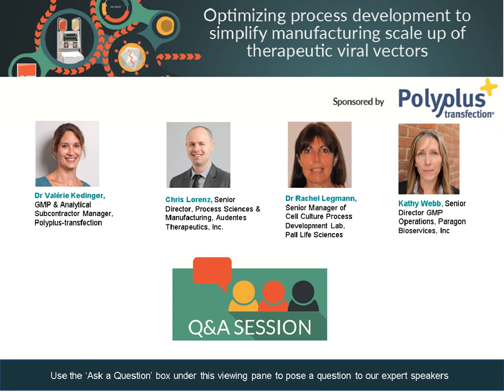And so just understanding what those critical aspects are of your critical raw materials, things like your DNA, your PEI or your other transfection reagents, it's critically important to, one, understand what those critical material attributes are, and then partner with your supplier to perform the right type of testing, to report on that, to set suitable ranges that are amenable to both sides of that equation. So this is something we're evolving over time, and as we get more of a relationship with vendors, these are the things we are looking at improving and getting more visibility to.